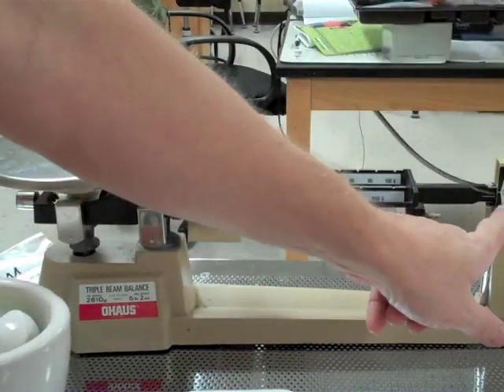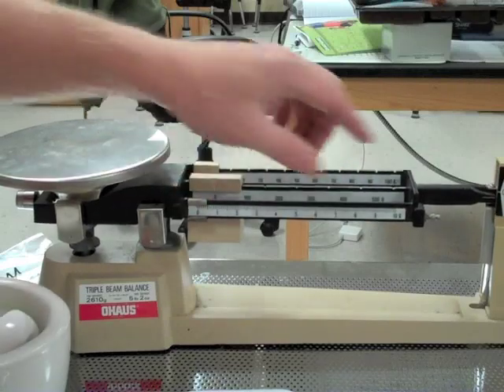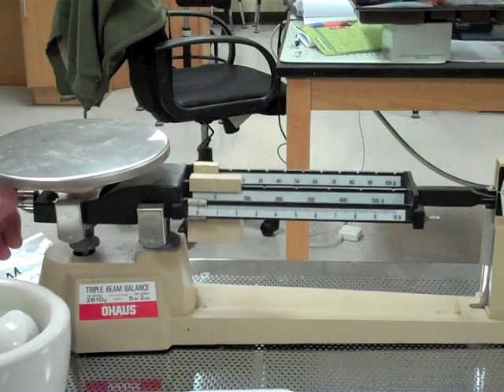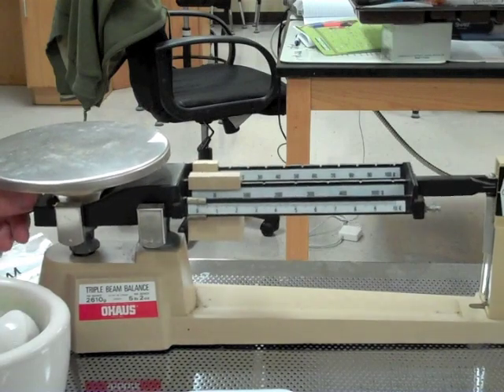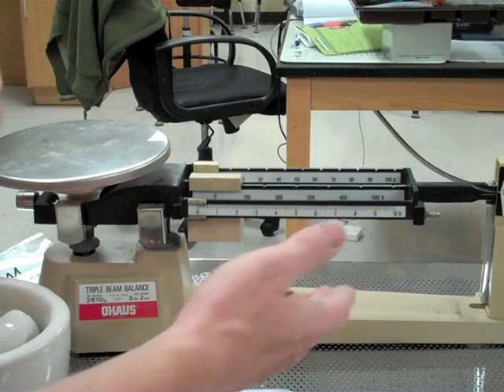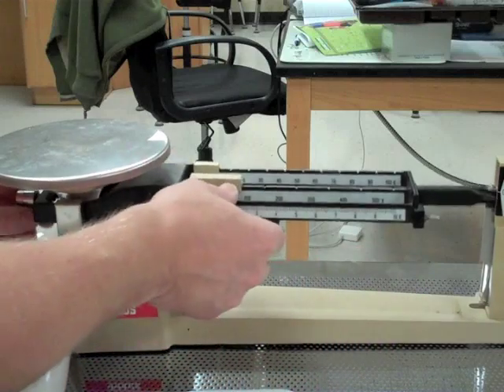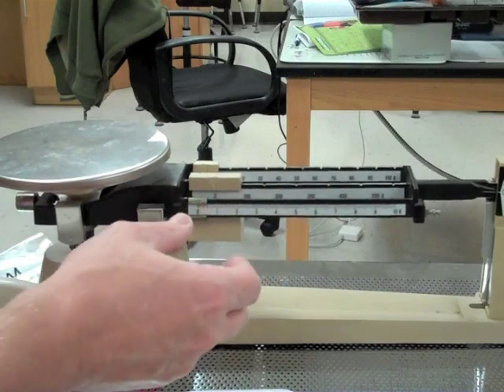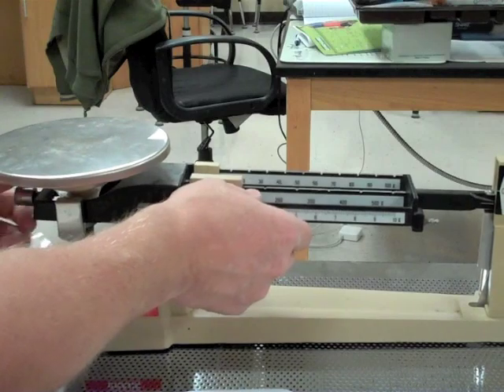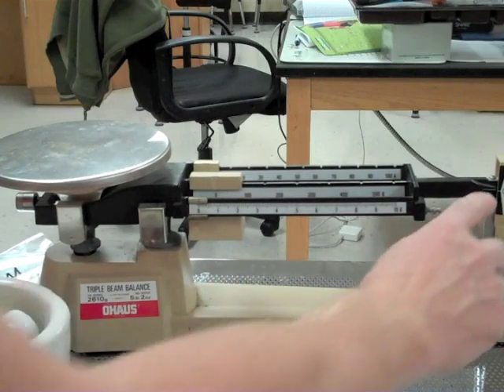If you notice right here, our lines are not lining up on the zero mark, and everything here is set to zero, so we should have our balance zeroed out. Underneath this pan right here on this side, there is an adjustment — like a little screw you can screw in or out. I need some more mass on this side to pull this end up, so I'm going to unscrew the calibration knob to get it to level out. And there we go — we're zeroed out.